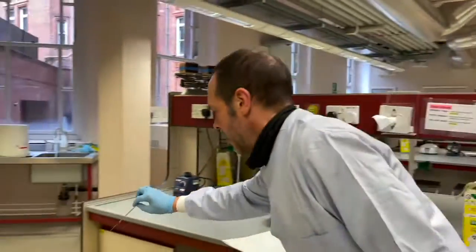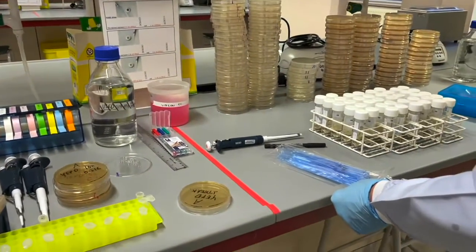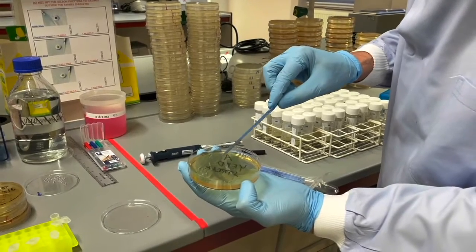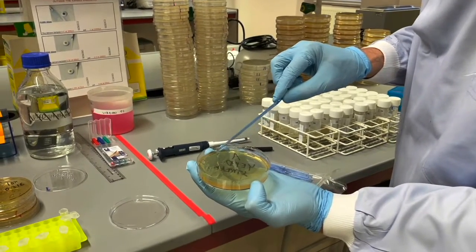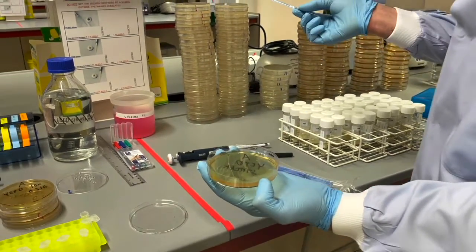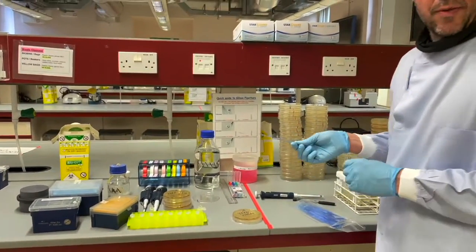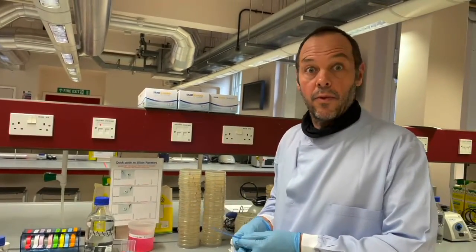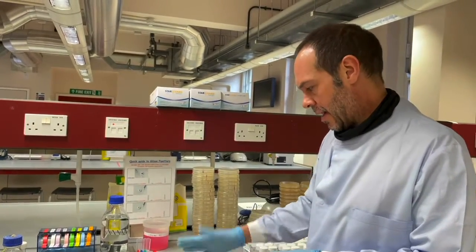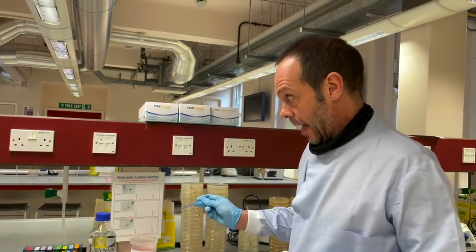And throw that away. And for the final one, use that last quarter of the plate. Pick up the cells at the end of the streak and fill the plate. So this isn't the way I would normally streak, but I think it's the most reliable, isn't it? Because we're doing four dilutions. So if you really had no idea how many cells there were, this would probably be pretty effective for almost any cell culture.